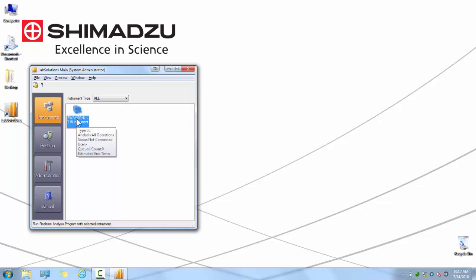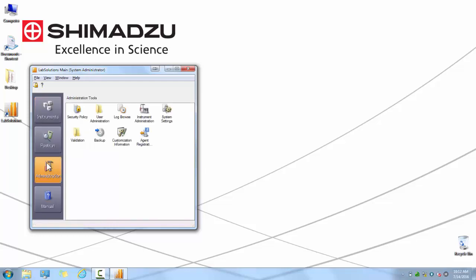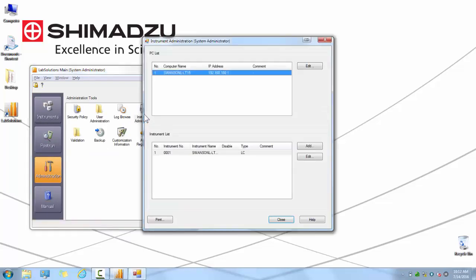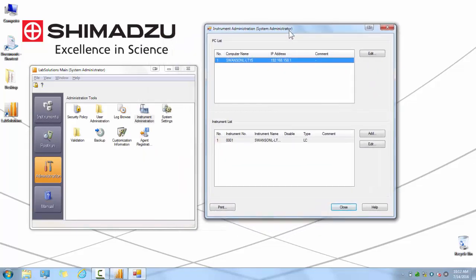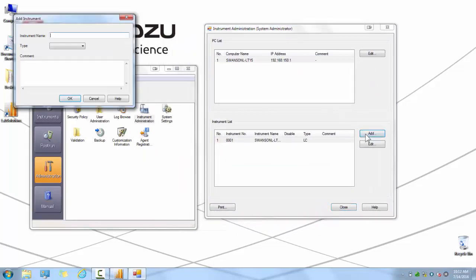To create a new instrument, first go to the Administration tab, double click on the instrument administration icon. You will see a PC list on the top and an instrument list on the bottom. From here, you can add a new instrument or edit an existing instrument. For the purpose of this video, we are going to add a new instrument.